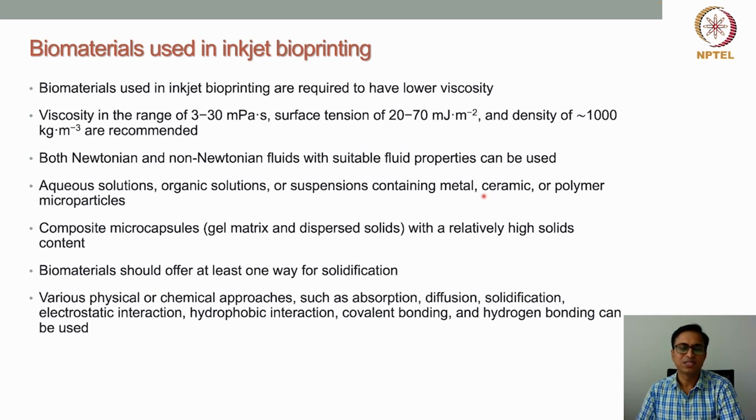Suspensions contain metal, ceramic or polymer microparticles. When these microparticles are suspended in a particular medium, that can also be used as a biomaterial for inkjet 3D printing.